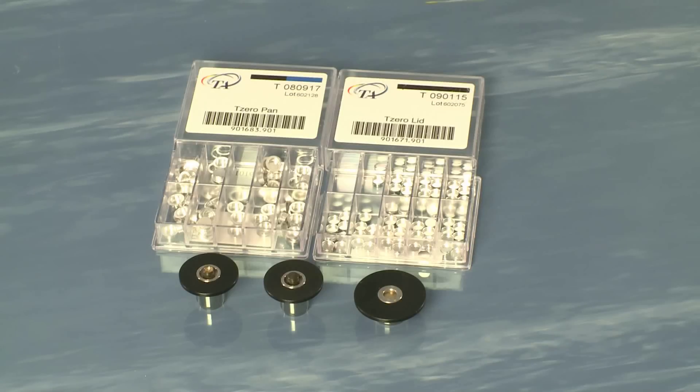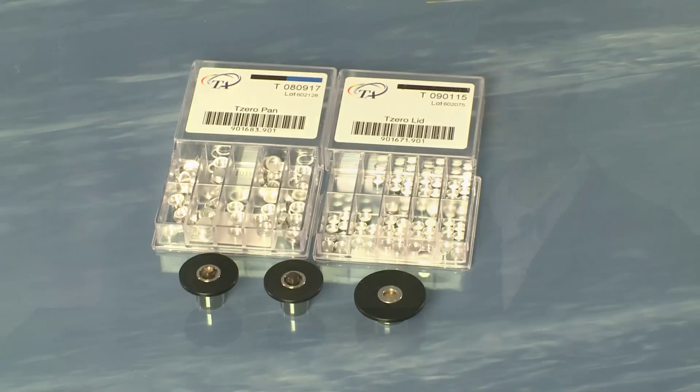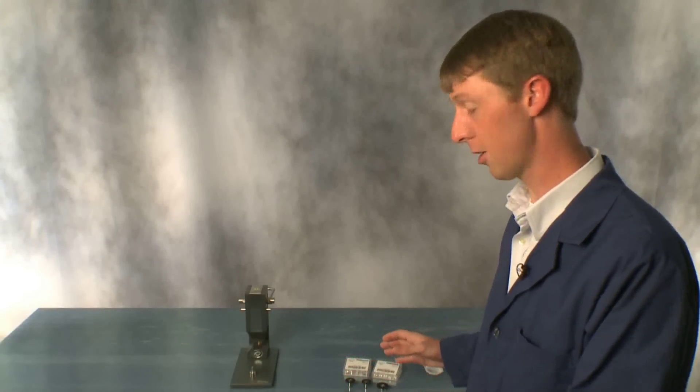There are two upper dies for the crimped pans. There's a flat die set which is used for powders and films, and a second hemispherical die that is used for more chunk type samples. I'm going to show you how to prepare a chunk sample.